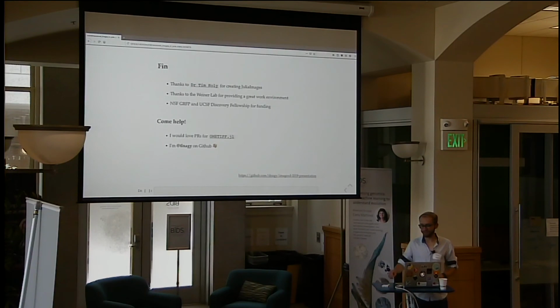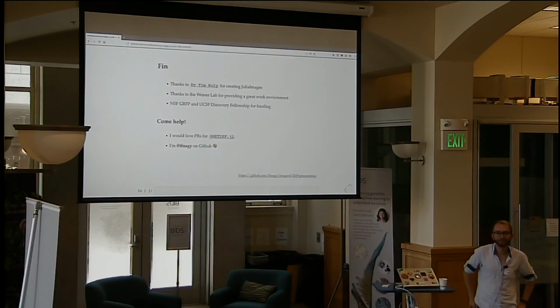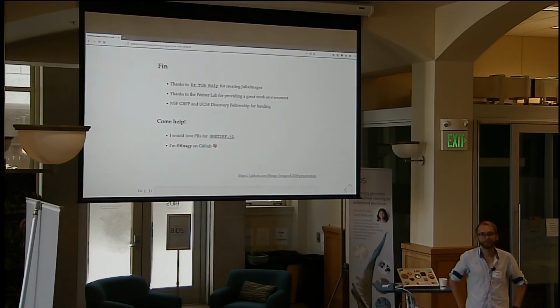I'm sort of curious to deal with pictures. We had a tutorial here using scikit-image, going from the image representation up to a series of transformations using more classical image processing, like edge detection and mathematical morphology.